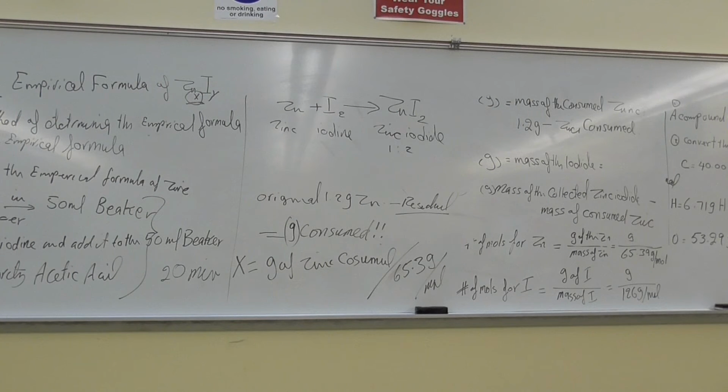So we have three balances here, and we have the zinc. I put the zinc and the iodine for you here. You can bring your own spatula and weigh with. And be careful, you don't want to mix both of them together. You need to have that so you clean. After you weigh the zinc, clean and then weigh the iodine.